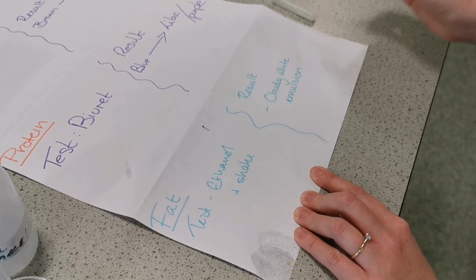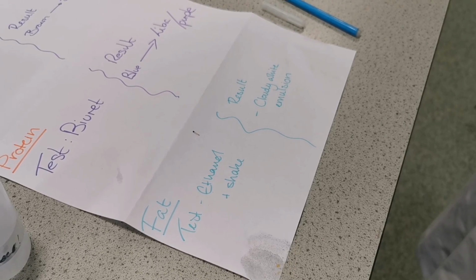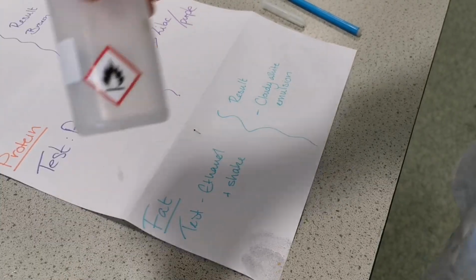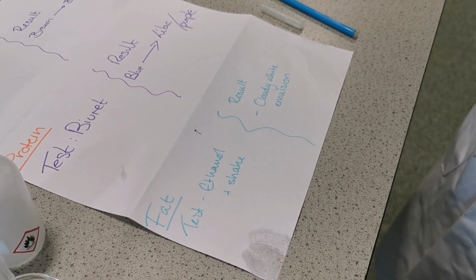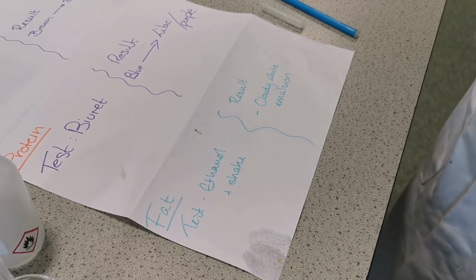What is ethanol, miss? Ethanol is an alcohol, and it's a very strong chemical, and it is very, very flammable, as you can see. But you cannot drink it. You don't want to drink anything in the lab. You do not want to drink the ethanol. Absolutely not.